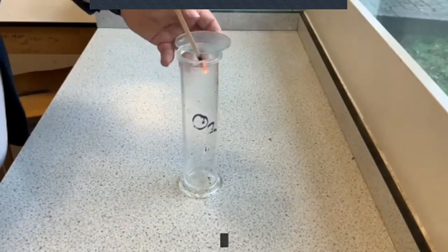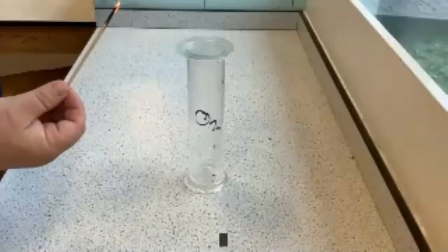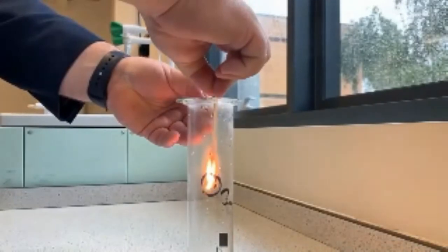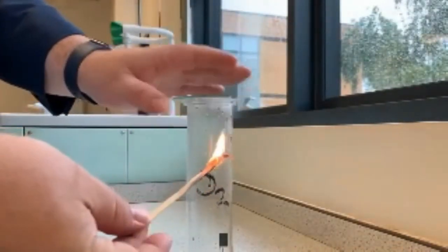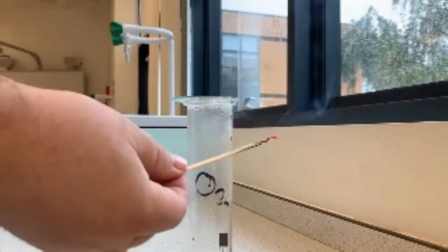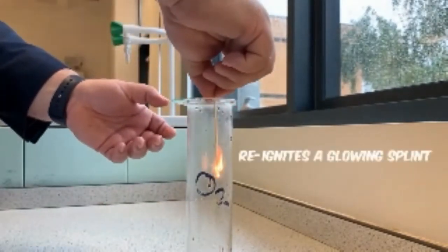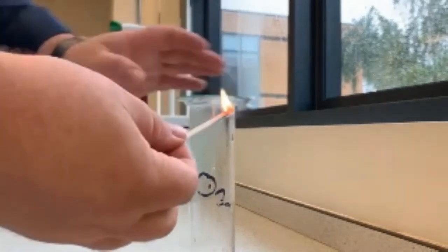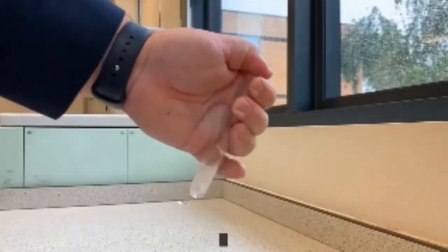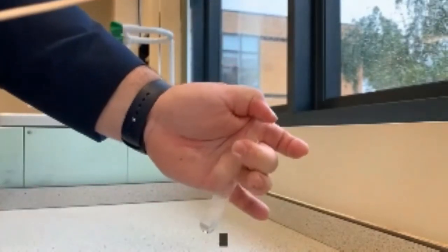Let's start off with a test for oxygen gas. As you can see here, I've got a gas jar and I've got a burning splint. The test is that if I put a glowing splint into oxygen gas, it should reignite. So let's have a look at that again. I've got a glowing splint, the flame's out, and when I put it into the oxygen, it should reignite. The test for hydrogen gas is that when you light the gas, it should make a popping sound, more of a squeaky pop sound. Let's listen.